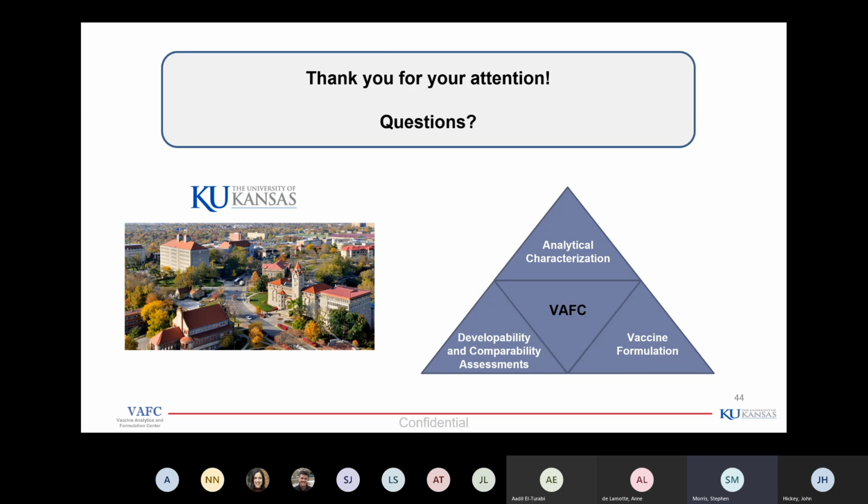And I'm wondering how often other people are looking at a gel and saying yes, that's fine, and in reality it's not, and how much that contributes to studies not being as active as people expect them to be. So I've been very much convinced that mass spec has a lot of contribution to determining product quality, even at very early stages.